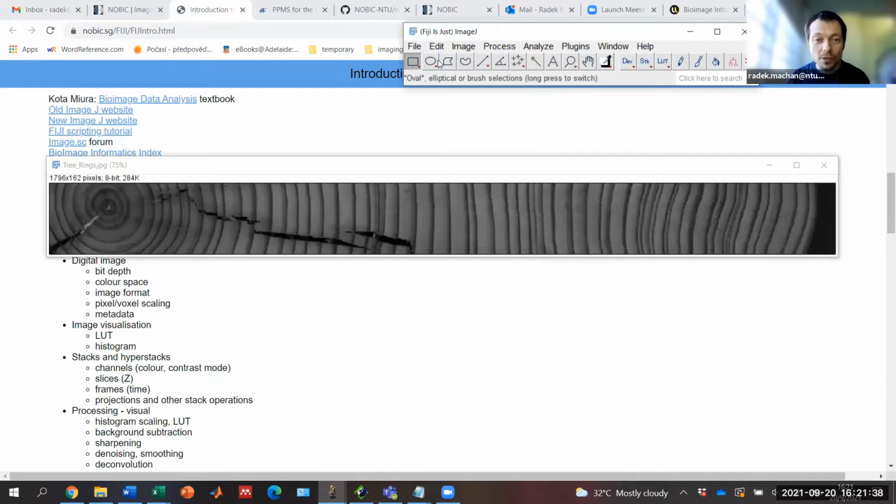But there's one more thing I want to show you. Unlike the spatial filters which we used, which were isotropic, so they basically didn't make a difference between the different directions in the image. You can of course do anisotropic spatial filters, but you don't have them readily available. You would have to program them yourself. But in Fourier Transform, this is something which comes in a very straightforward way.